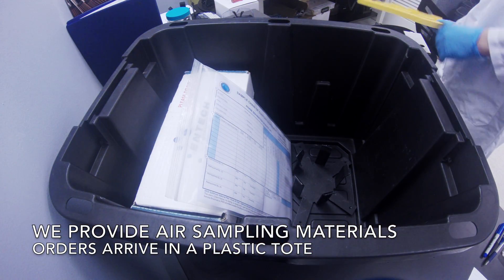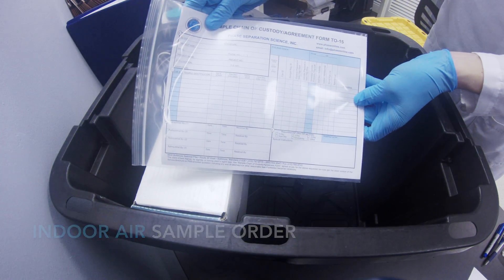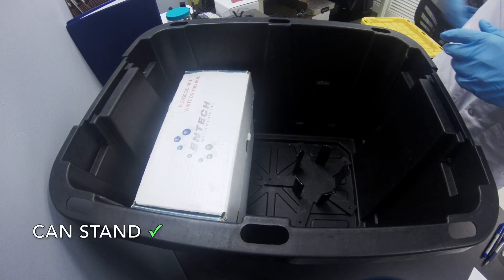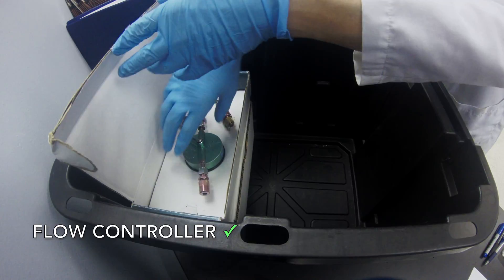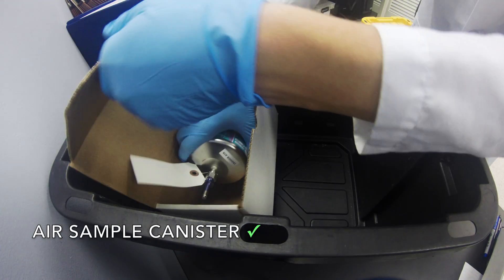The first type of air sample is an indoor air sample. Orders will include a chain of custody, sampling instructions, a can stand, a flow controller, and a sampling canister.